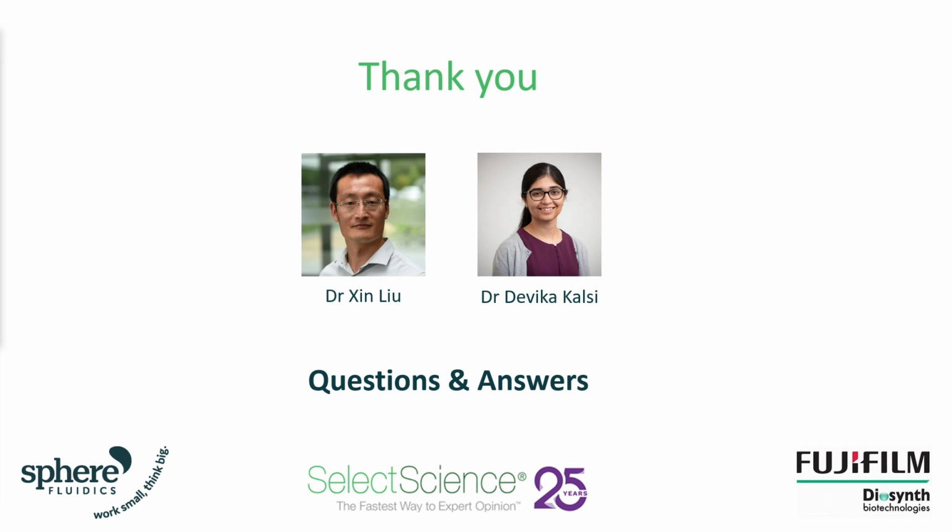Thanks. Another question: are there any other assays you can use for other types of antibody formats to select high producer cells? Yes, in general, we provide an off-the-shelf assay kit called Cyto-Select that has been optimized to specifically detect human IgG or human Fab fragments. As I said, the advantage of using FRET is that the user can customize the assay for their specific molecule of interest. All you need to do is find a pair of recombinant probes that can both target the protein of interest.